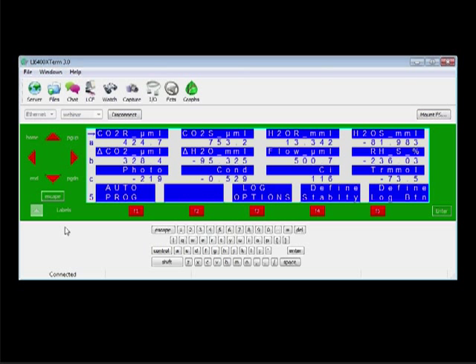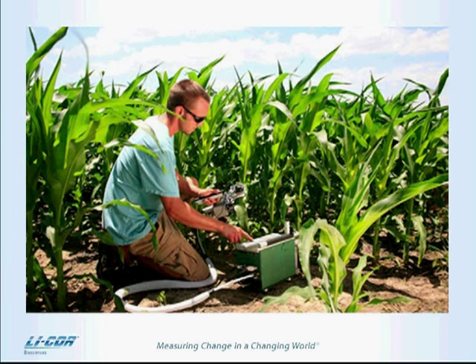Yeah, I do have a question. Someone has asked, can I still use the old auto programs? I understand that. You get used to using the old auto programs. You've built your research program around them, and then we have these new auto programs. The old auto programs are still there.